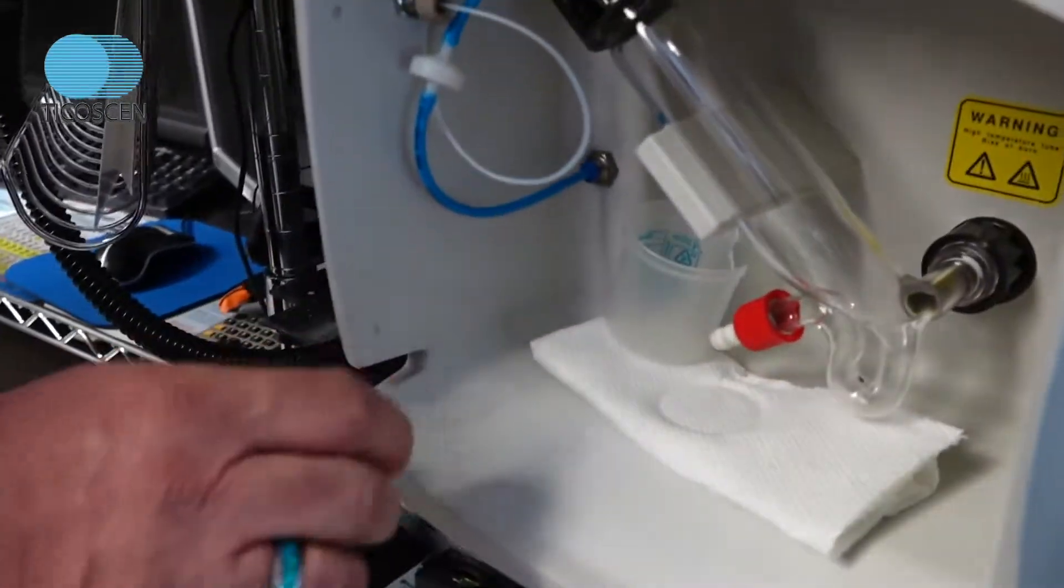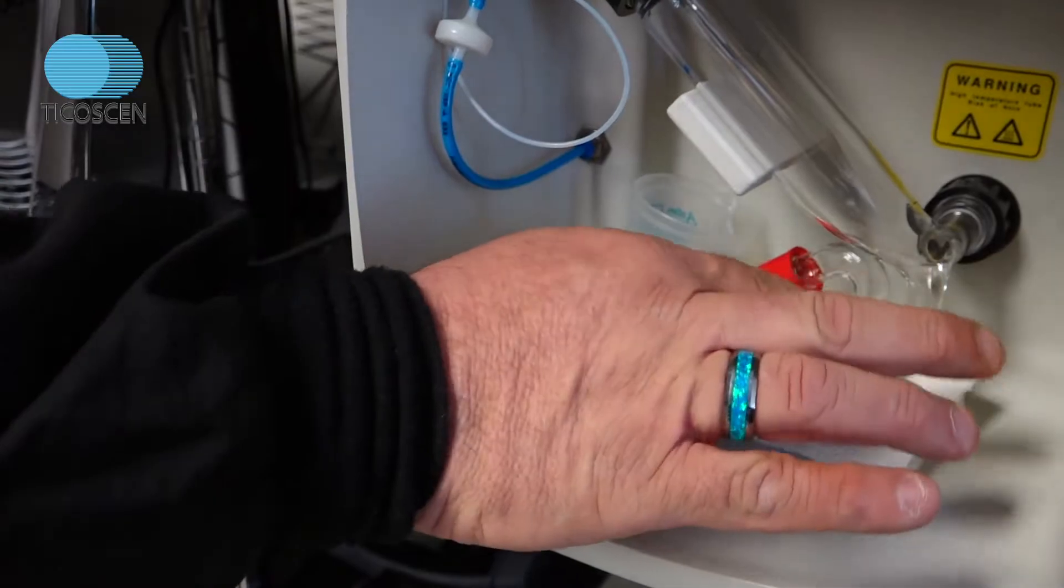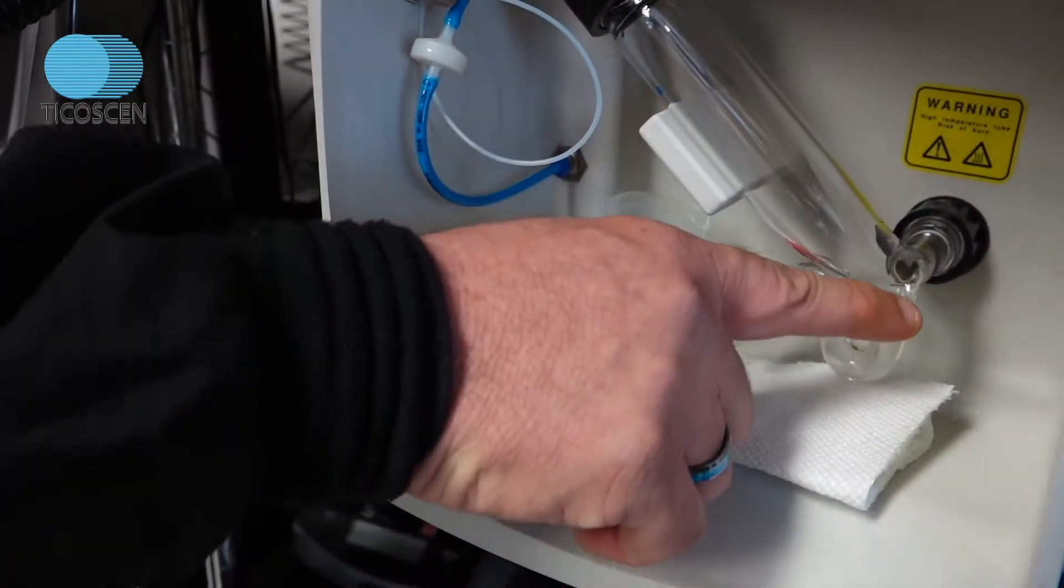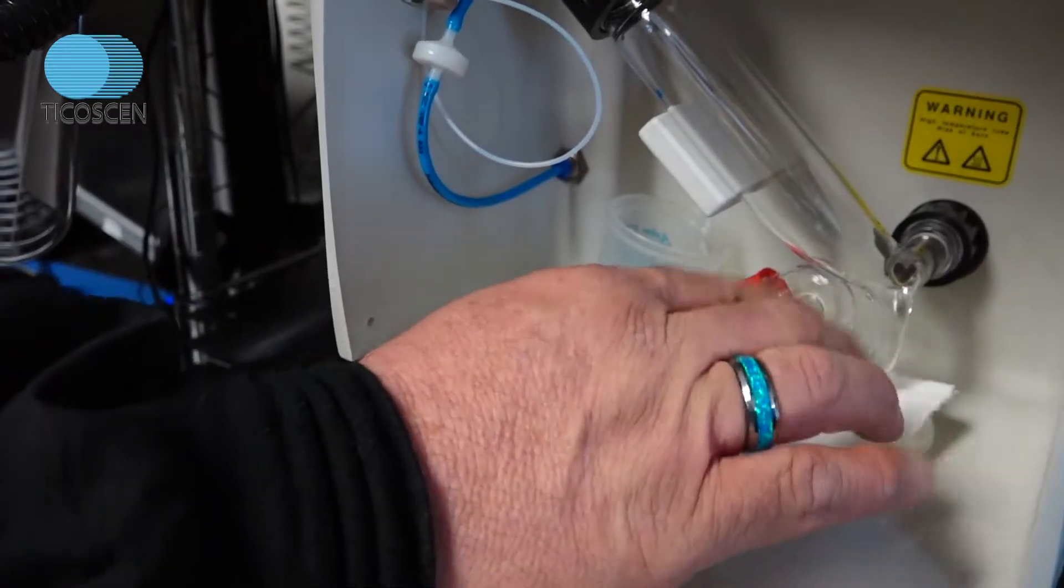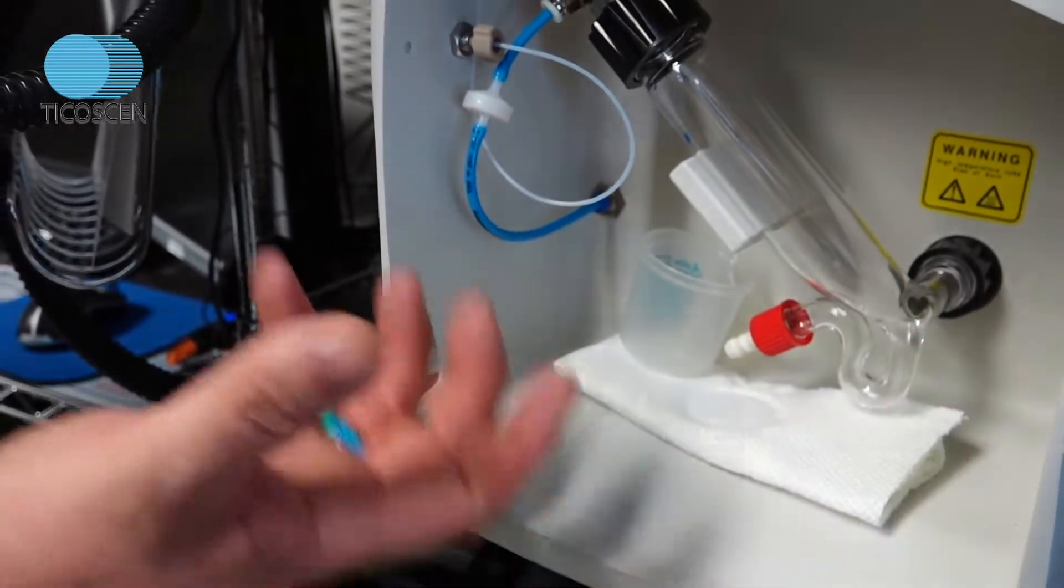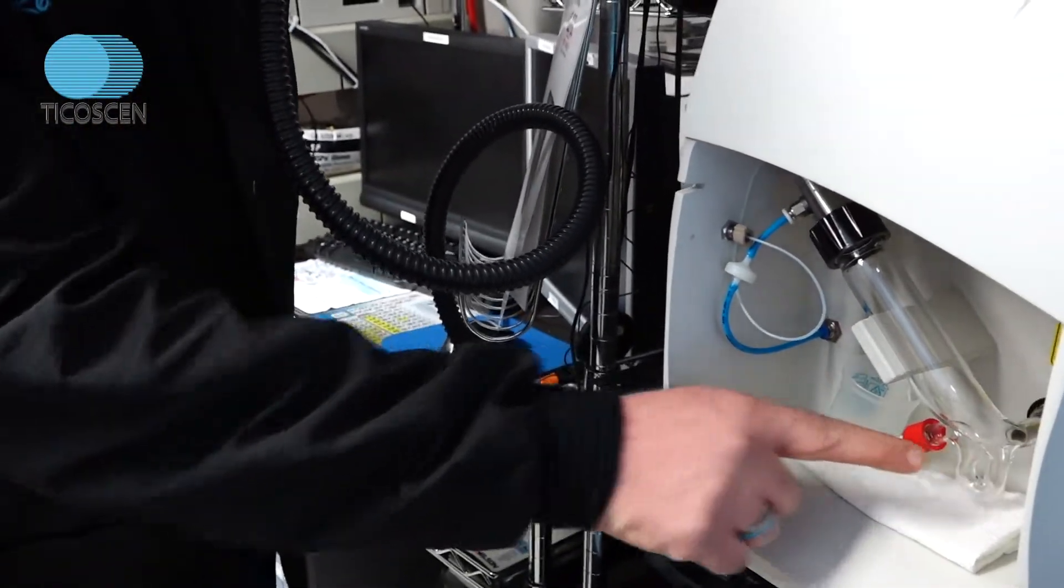You want to see a very stable liquid level in this U-trap. We call this the gooseneck. And you want to see equal meniscuses of liquid in this little U-shape. And if it's bubbling in or blowing out, you have a pressure differential issue. You want to have a stable liquid slug here.